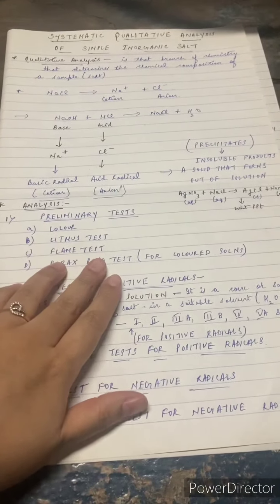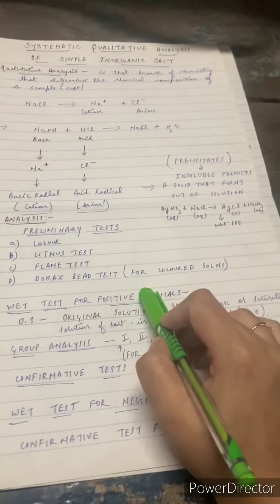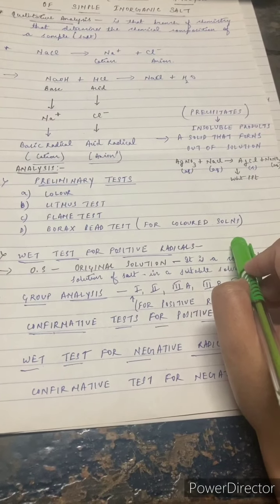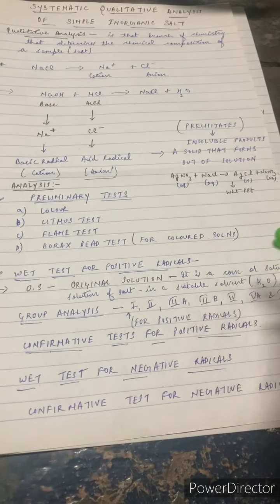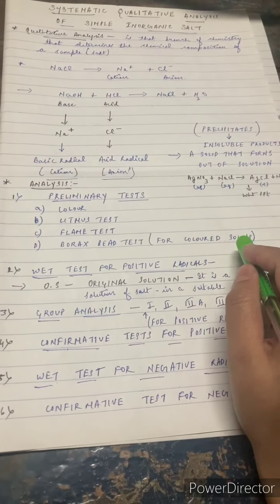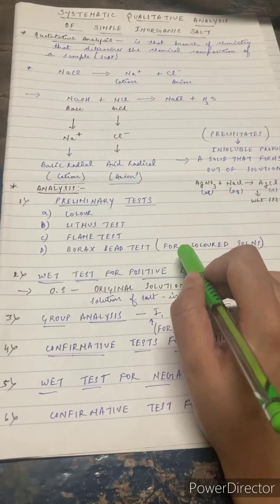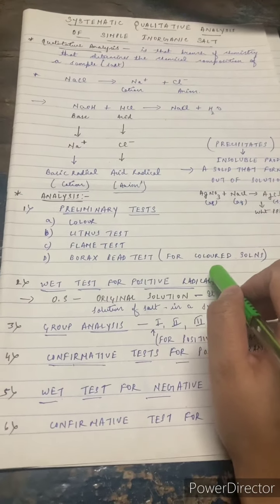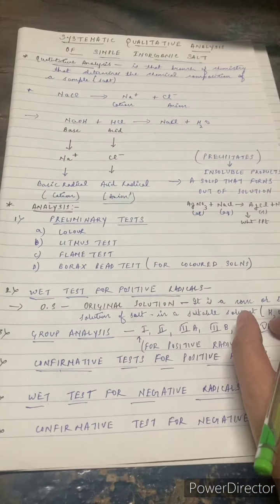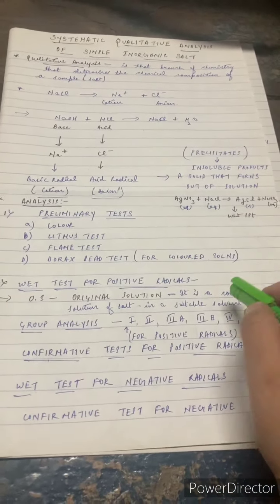The third is the flame test. Now, every metal ion or every cation has a characteristic emission spectrum, meaning a flame color. Some metal ions may not have any flame color. So for those metal salts which do not have any flame color, we will write it as no particular flame. But for those metal ions which give a characteristic flame, we will write the color. If golden yellow is there, I will say sodium ion is there. If I say that pink flame is coming, I will say that potassium ion is there.